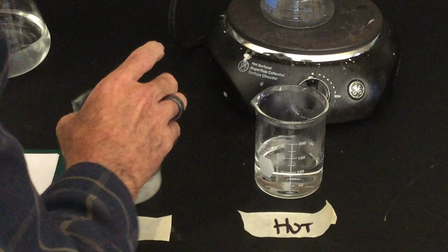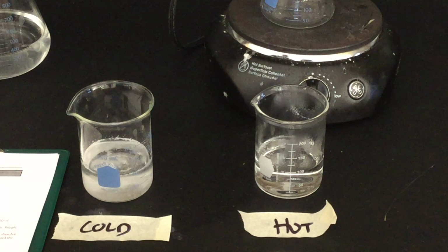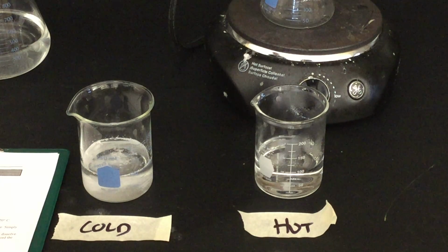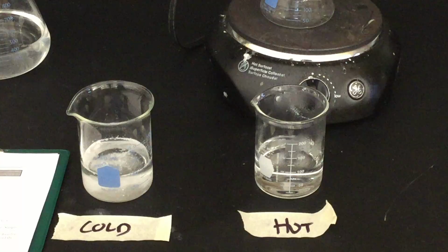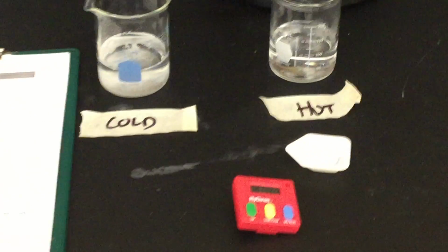Okay, so the bubbles are slowing down and it looks like it's pretty much dissolved. And we have 1 minute and 44 seconds for the cold water. So I'm going to record that as 1 minute and 44 over here on the sheets that we have right here. So again, we'll summarize that later.